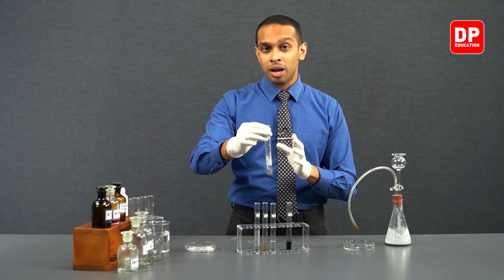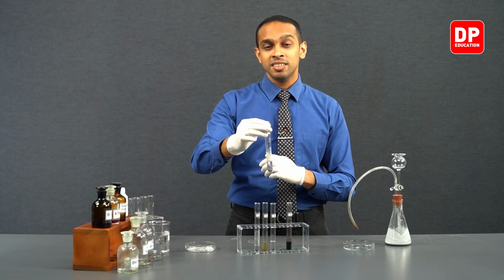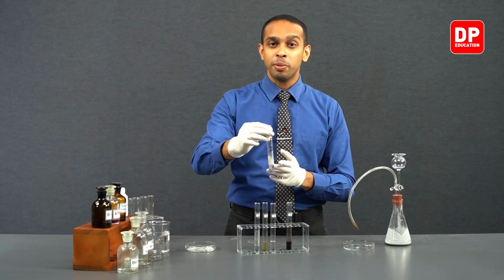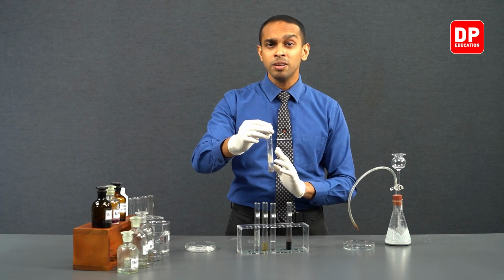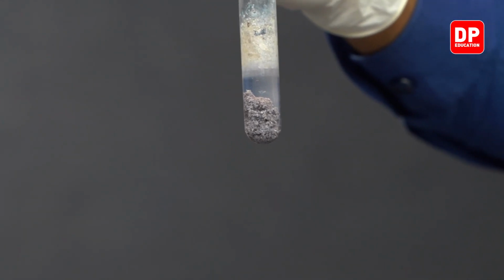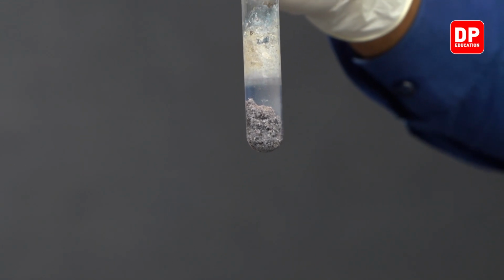When it comes to alkynes containing terminal hydrogens, they can react with heavy metals such as silver plus ions and copper 1 plus ions and form metal acetylides, which are water insoluble precipitates. So what you see here is a metal acetylide named silver acetylide, which is a water insoluble grayish precipitate.